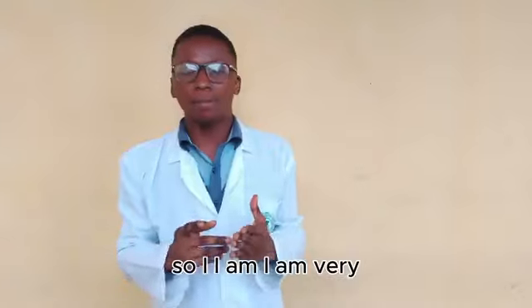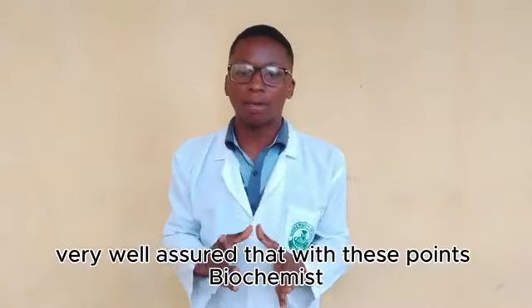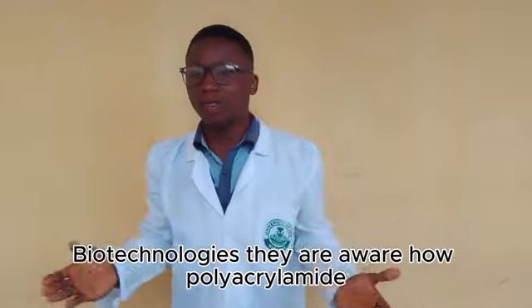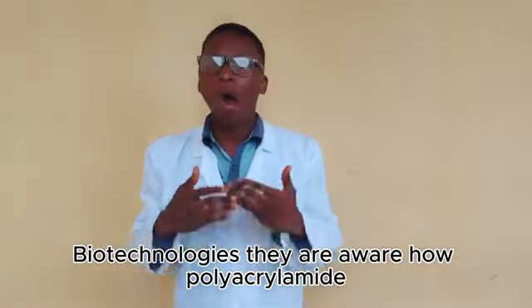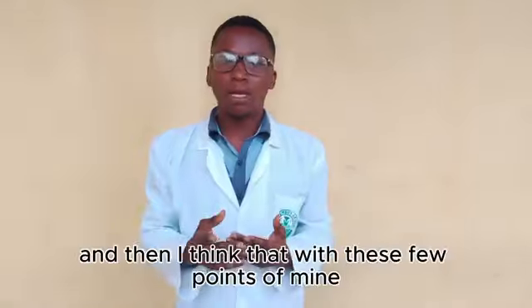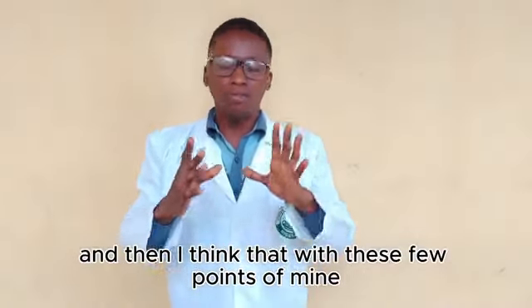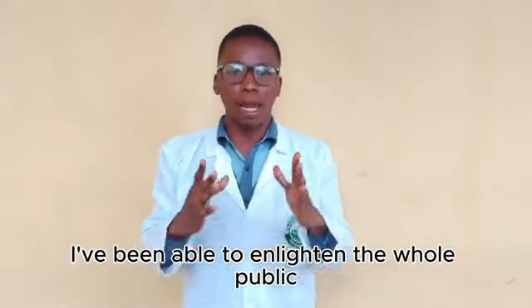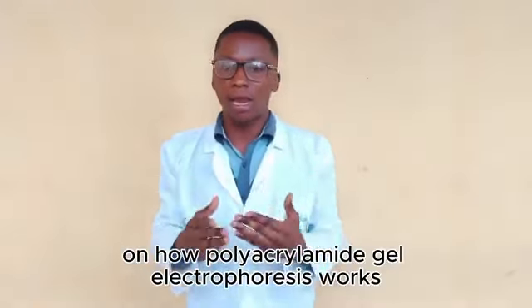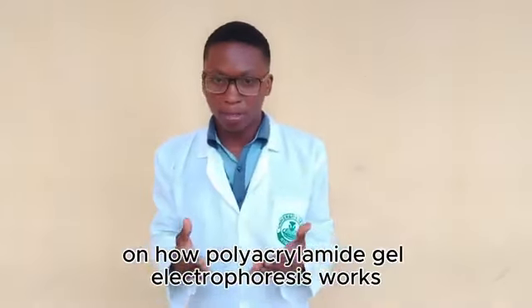So I am very well assured that with these points, biochemists and biotechnologists are aware of how polyacrylamide gel electrophoresis works. And I think that with these few points of mine, I've been able to enlighten the whole public on how polyacrylamide gel electrophoresis works.